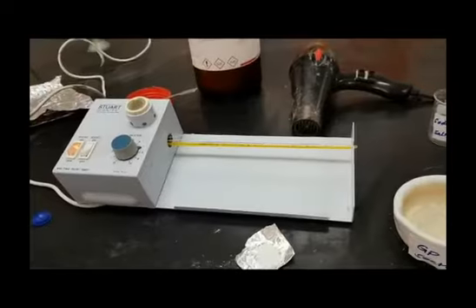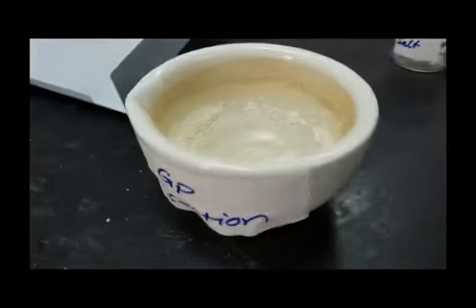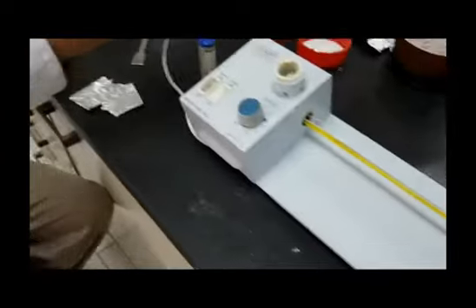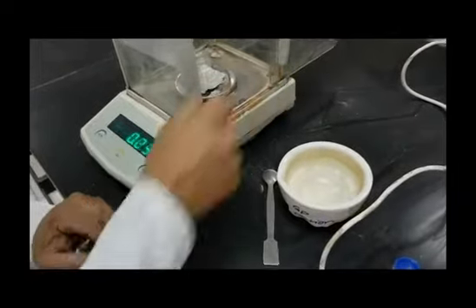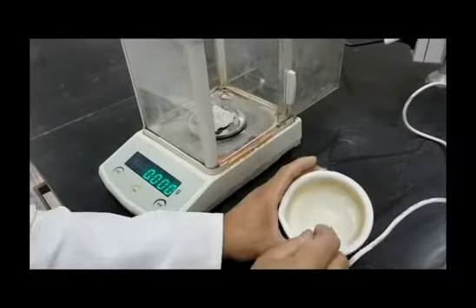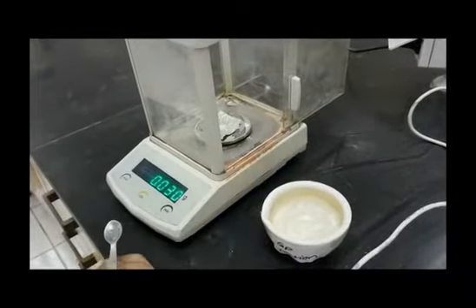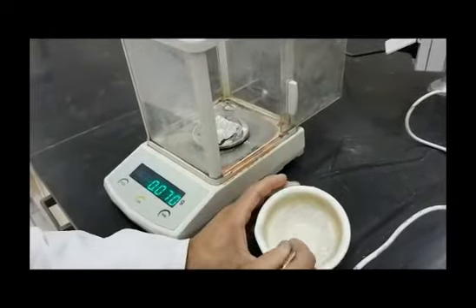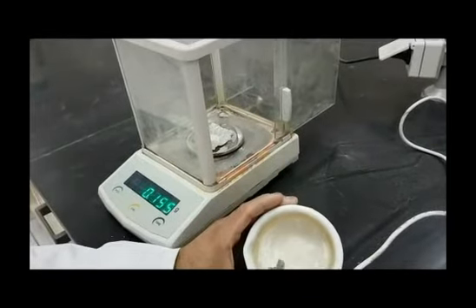After that, we will measure the aqueous solubility of the prepared salt, and we will compare it with the aqueous solubility we will measure for the acid, mefenamic acid. We will use again the approximate solubility concept. Again, we are measuring the solubility of mefenamic acid using the same method, approximate solubility, for comparison.